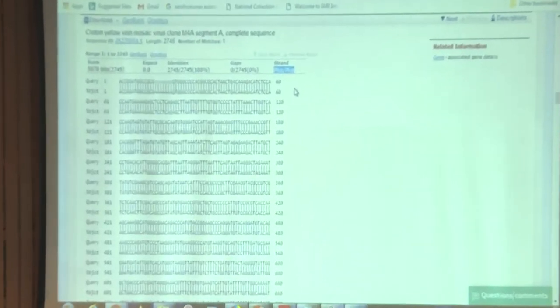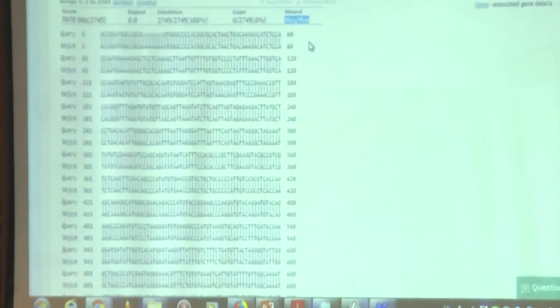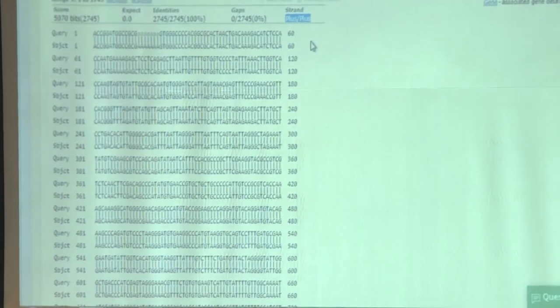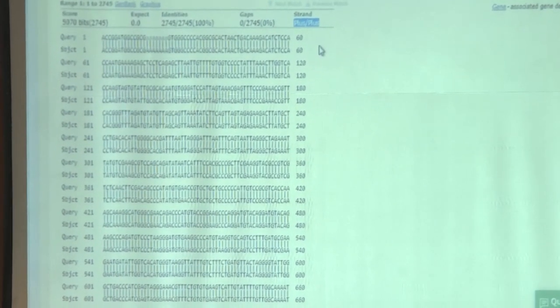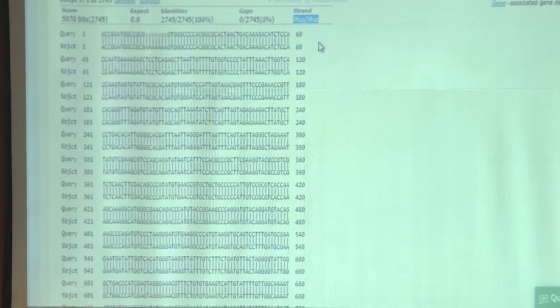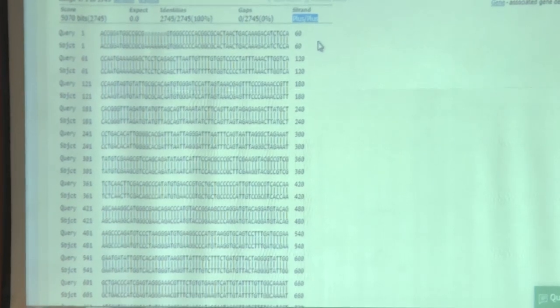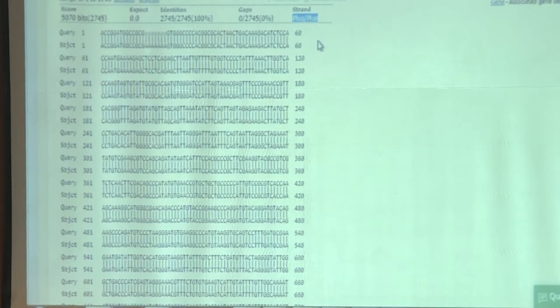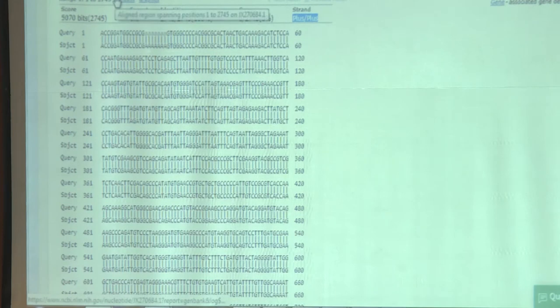Okay, it should not have plus or minus. On Friday, we discussed in length how to do the reverse complement, so that will help you here. Again, you see the majority of them are plus. If one or two are minus, you put the minus ones into plus. If the majority of them are negative and one or two are plus, then you put the plus ones into negative. You got it? So everything should be harmonized, length as well as orientation.